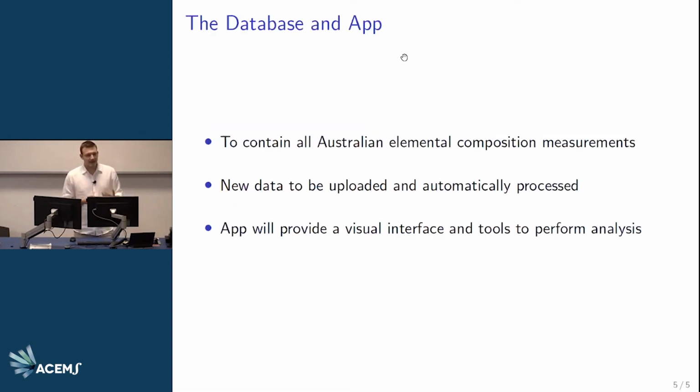We've been working in collaboration with Forensic Science South Australia to build a database of elemental composition from all Australian casework. This database will be such that any new data can just be uploaded and automatically cleaned and processed. Then the app will provide a visual interface allowing analysis to be performed, and all of the tools that are needed for that will be included in this app.